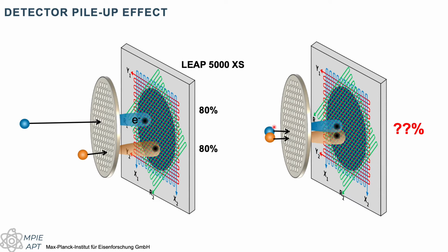And I've mentioned before that when an ion strikes, the microchannel plates need to recharge. So if one ion strikes the detector at that position, and a second ion comes exactly at that position afterwards, after a very short amount of time, can the detector detect the second ion?